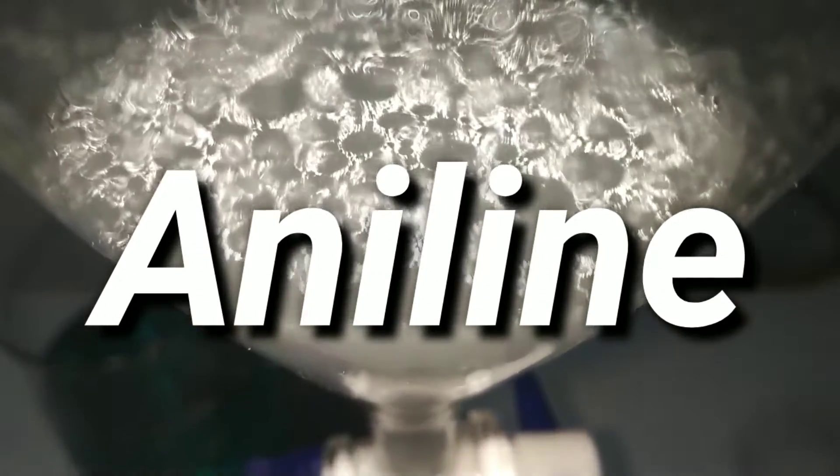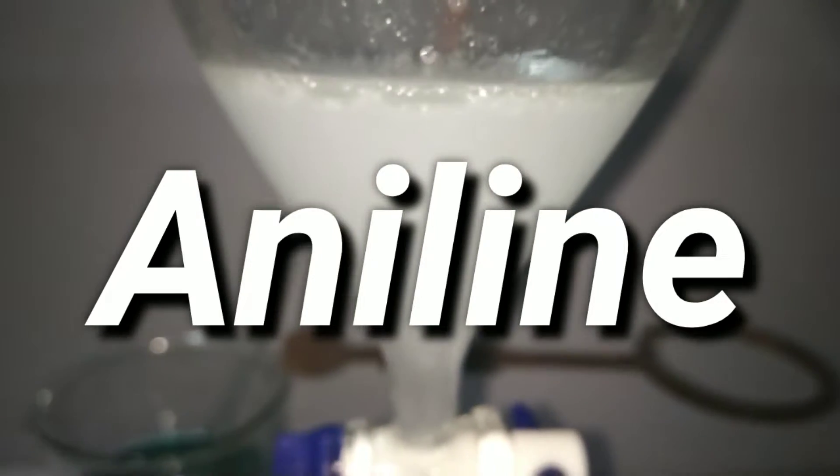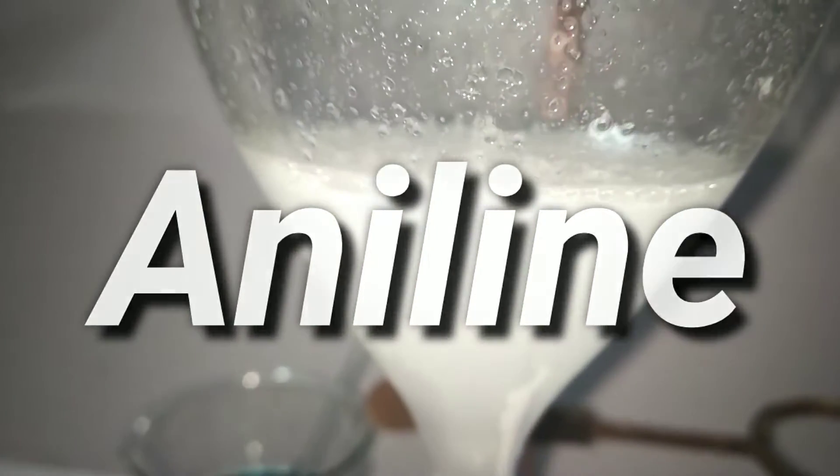Hello friends. In this video, we will synthesize aniline by the reduction of nitrobenzene.